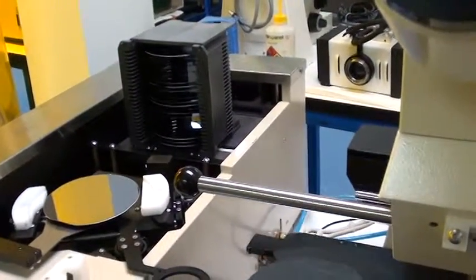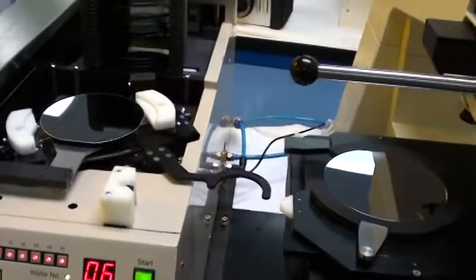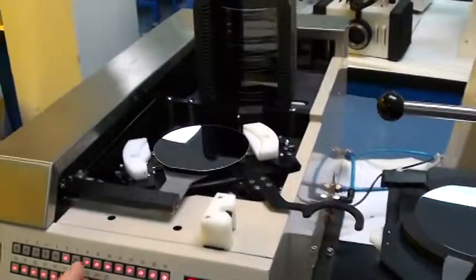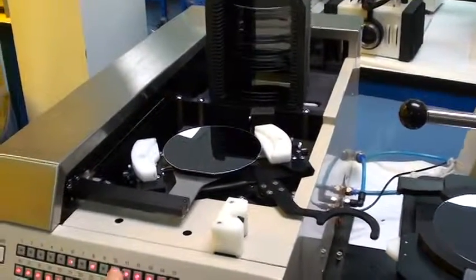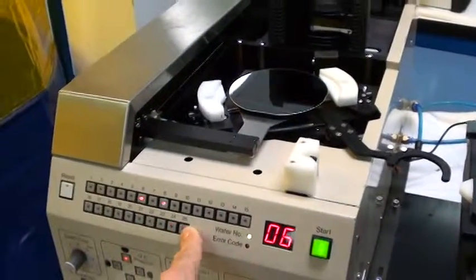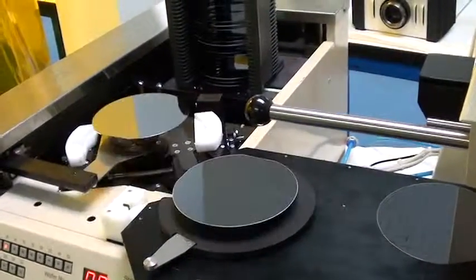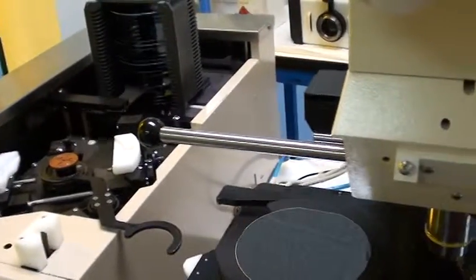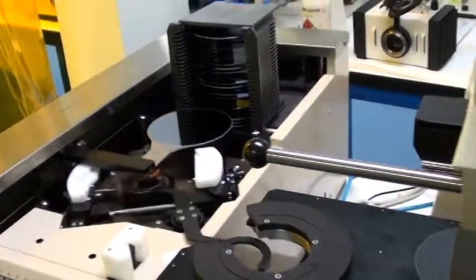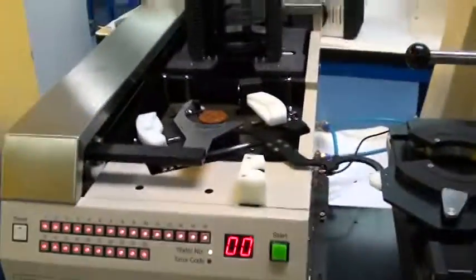If I decide I want to halt the process and not select any more wafers, I can press manual at this point, and then switch off all the other wafers. Now it will not pick any more wafers — it puts the wafers back.